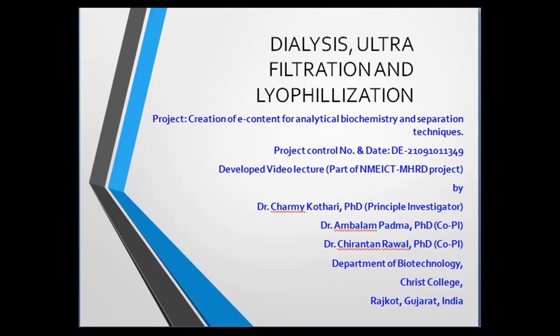Hello students, let us learn the separation techniques like dialysis, ultrafiltration and lyophilization in a simple way. To start with, we'll just go through dialysis.